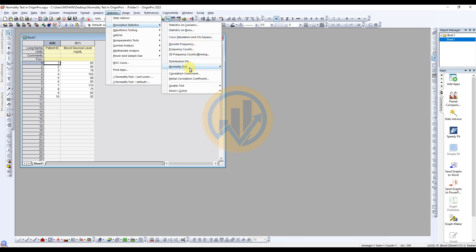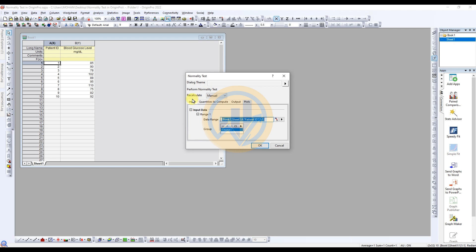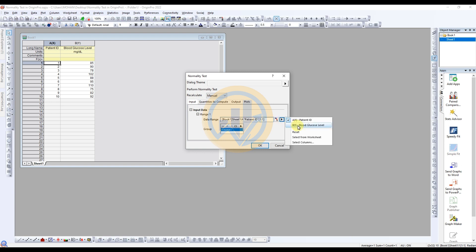Go to the Normality Test option, which opens a new dialog. In the normality test dialog, the recalculate option is set to manual, and the input option is set to input data. For the data range, choose the option and select column B (Y) for blood glucose level. The group is set to none.